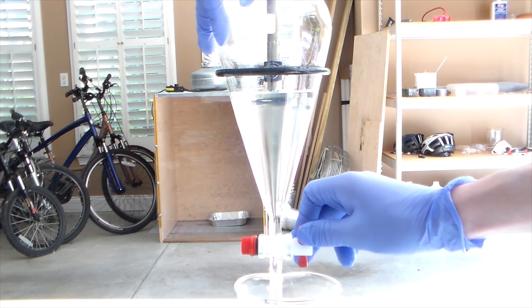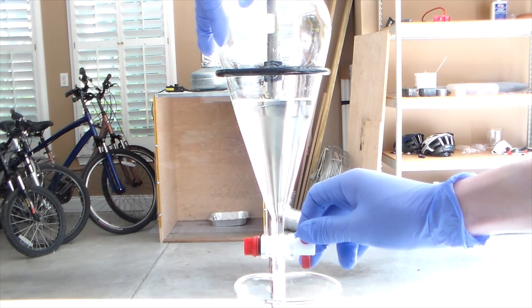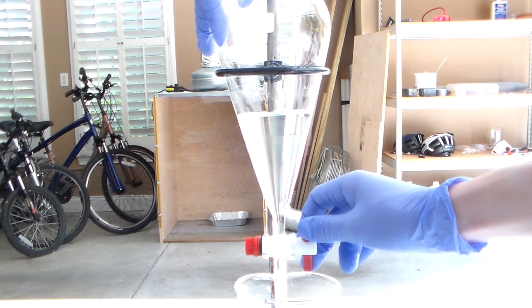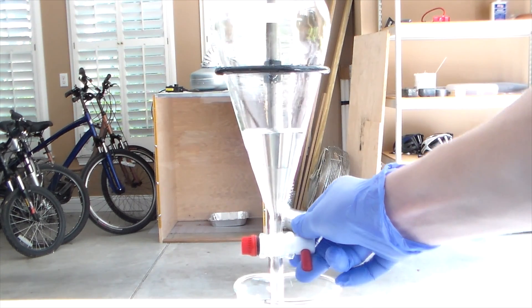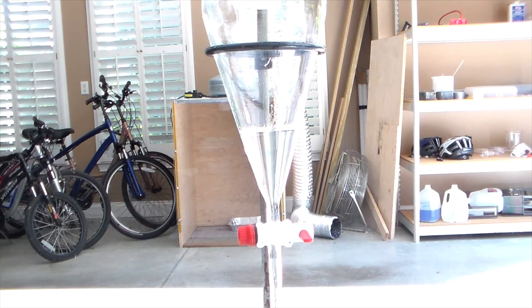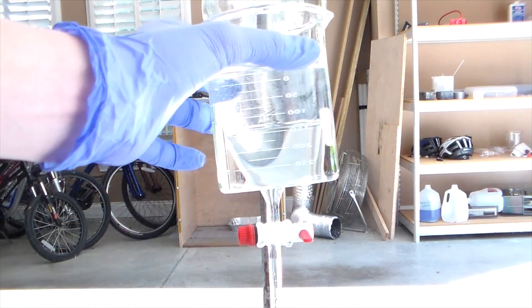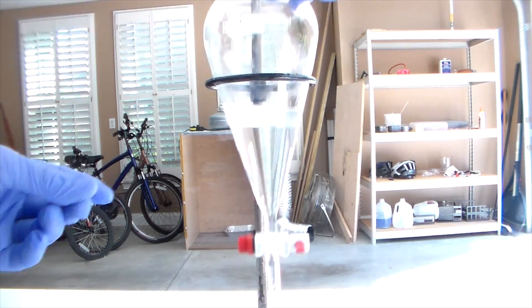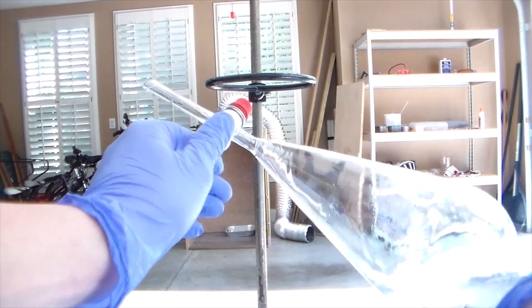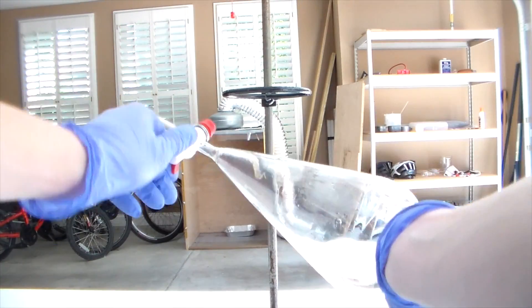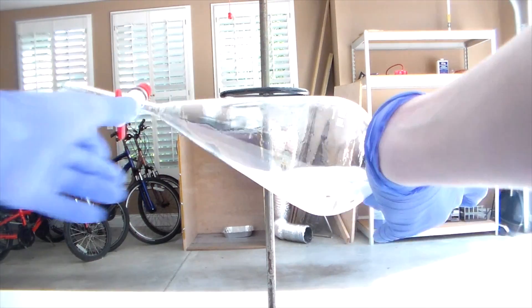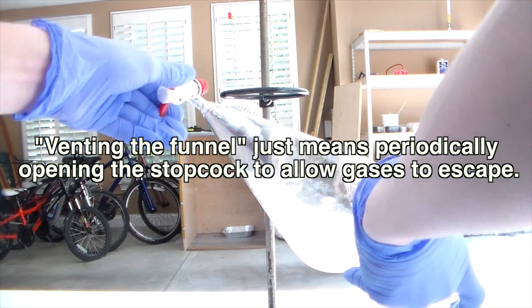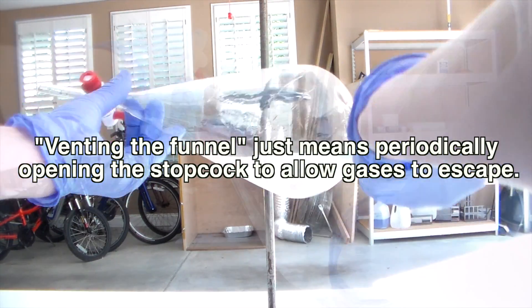After the layers separate, remove the bottom aqueous layer and retain the top layer, which contains the tert-butyl chloride product. Wash this layer with a 5% sodium bicarbonate solution and shake the funnel to mix the layers. Because we are neutralizing an acid with sodium bicarbonate, a bunch of carbon dioxide gas will be produced. Make sure to vent the funnel frequently to release the gas and prevent the buildup of pressure.